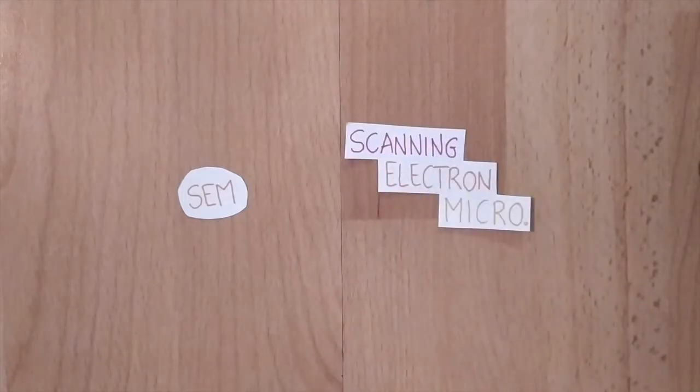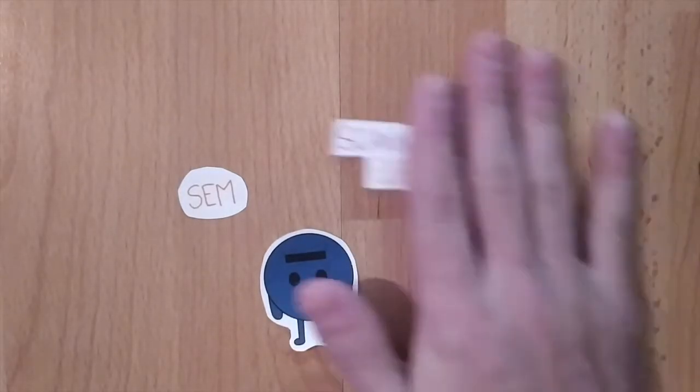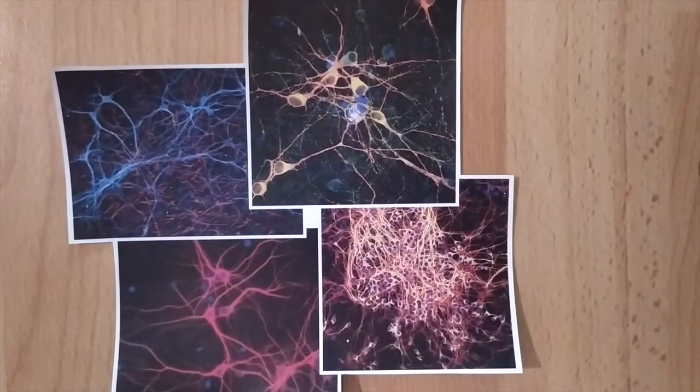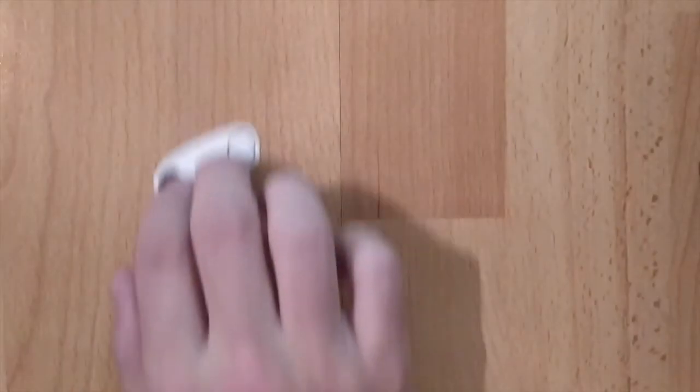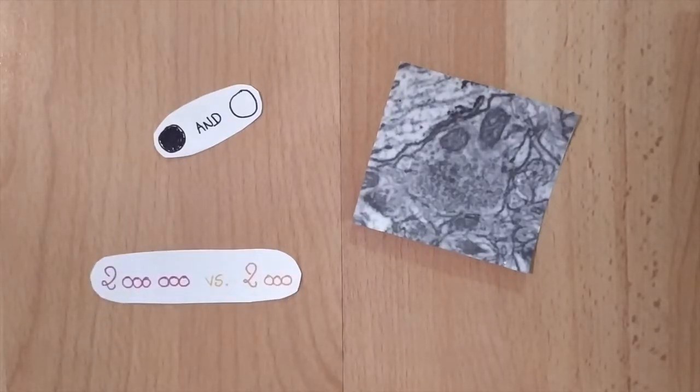Also known as scanning electron microscopy, this imaging technique implies electron and will produce beautiful microphotographs. Forget all you may think about neuroimaging, the colorful and fluorescent pictures you've probably seen. Now we'll talk about black and white, or in fact gray, and trust me, you will like it. This technique, no matter how ugly it looks, is the most precise one. With a 2 million power magnification against 2000 in optic microscopy, you're pretty much able to see everything.